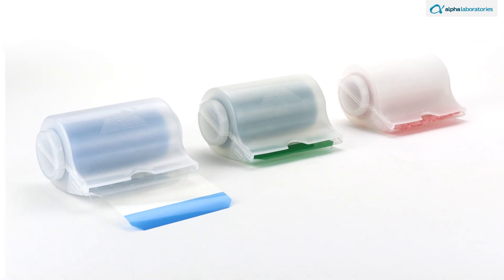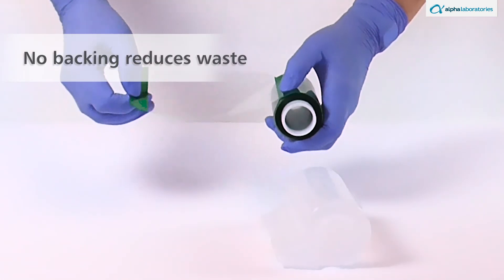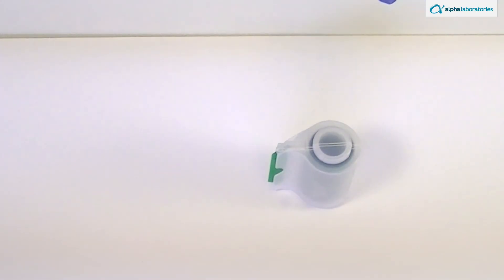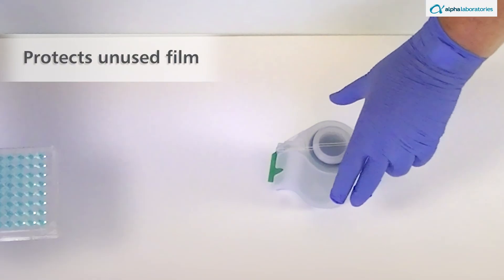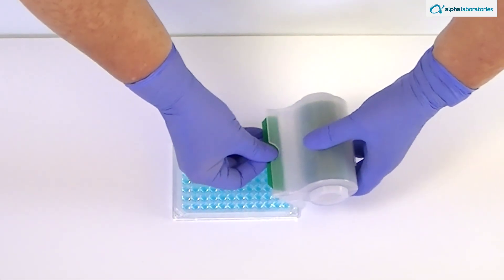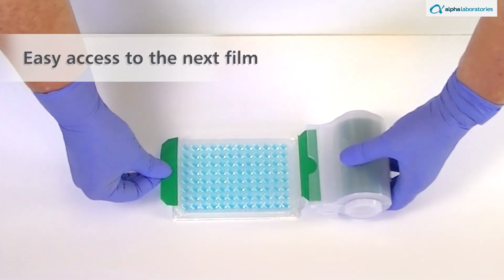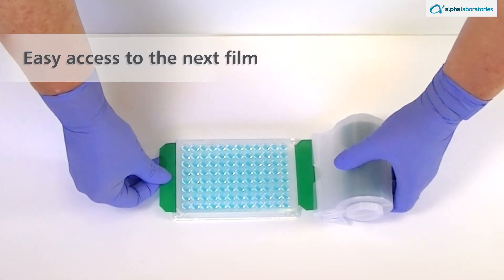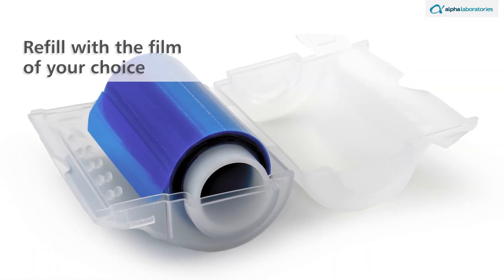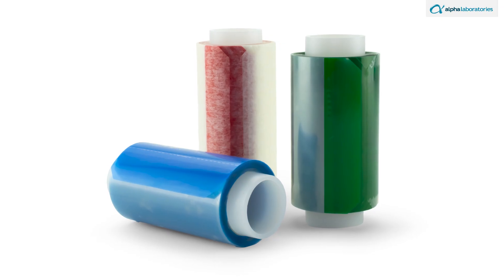This Seal Mate roll format offers a quick, convenient sealing method whilst reducing waste, with no protective backing to remove or discard. The Seal Mate dispenser protects unused films and keeps them accessible for sealing subsequent plates. Thumb and four-finger notches at the dispensing bill provide easy access to the non-adhesive band, allowing the next film to be pulled smoothly. The reusable Seal Mate dispenser can be refilled with the film of your choice.